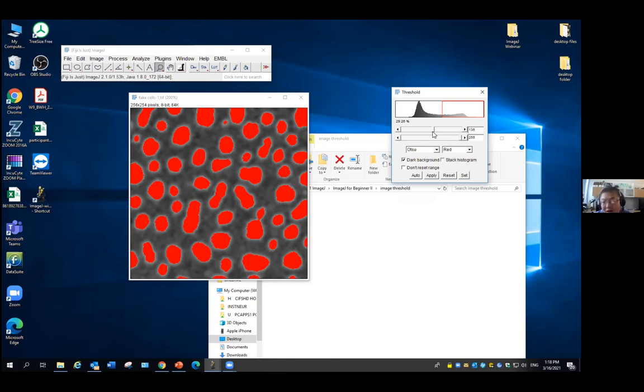It's always how consistent your analysis is. You use the same protocol, the same treatment on all the images. All the images are taken under the same condition, and you analyze them the same way. Then when you get results, you can compare them with each other. It's always the comparison, the consistency, which matters.